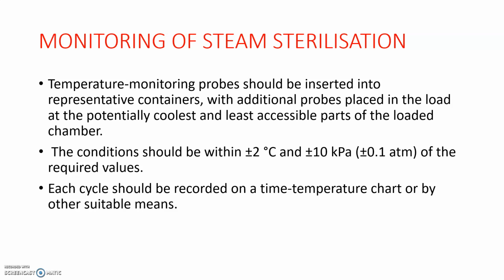A chart is provided with headings of time and temperature, and after each cycle the time and temperature are marked on that chart. From this we can evaluate whether the steam sterilization is accurately performed. This is the method.